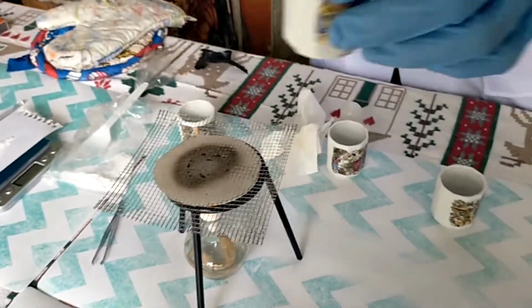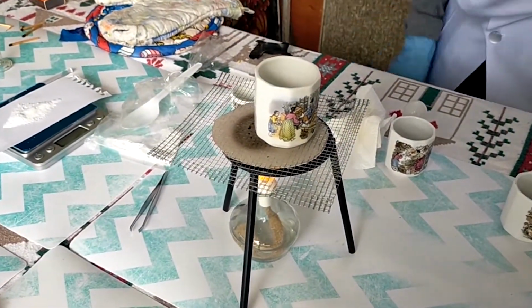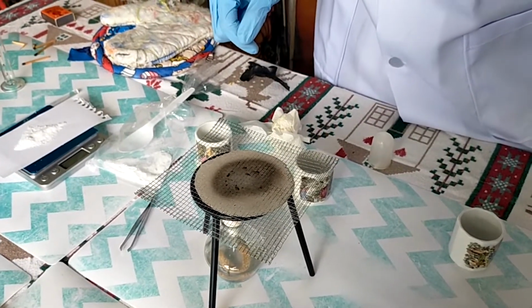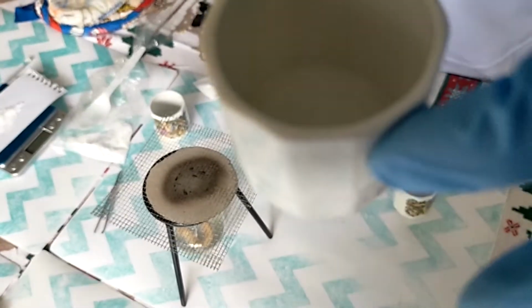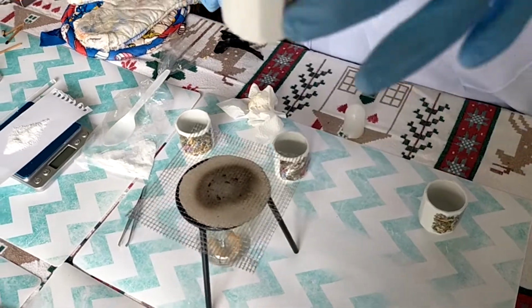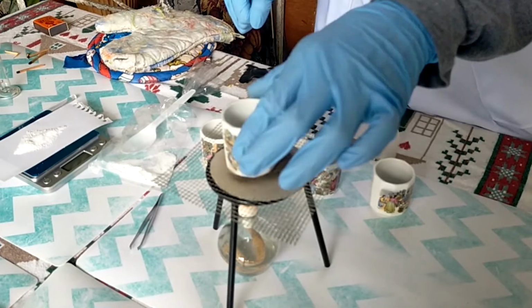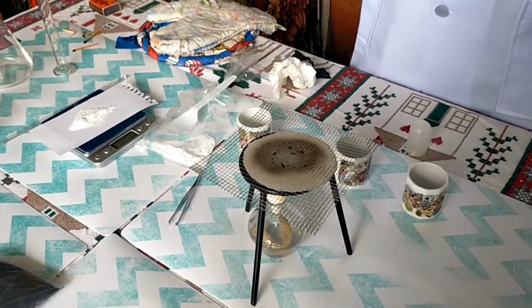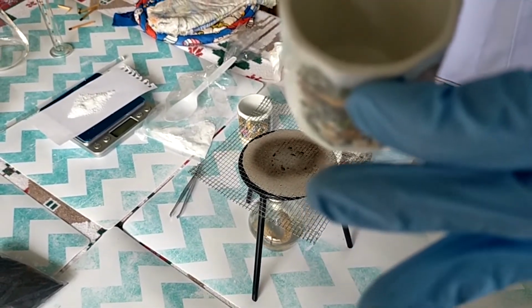Now we will go with ethanol. So after heating, you can see here. Now we will go with the ethyl acetate.